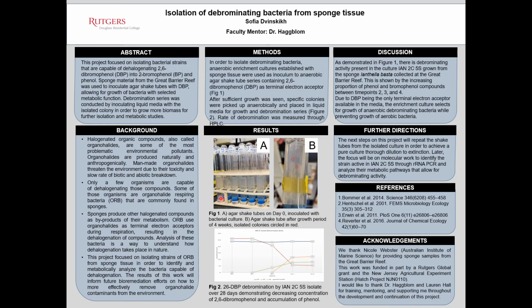Figure 1 demonstrates the week 0 and week 4 of the agar shake tube setup. 1A, shown on the left, demonstrates the shake tubes immediately after inoculation with a sponge sample, and the serial dilution from a factor of 10 to the 2nd to 10 to the 8th.